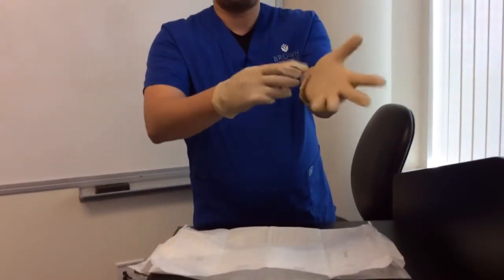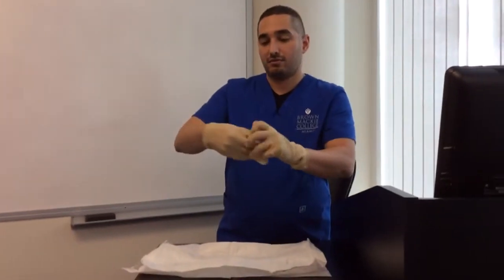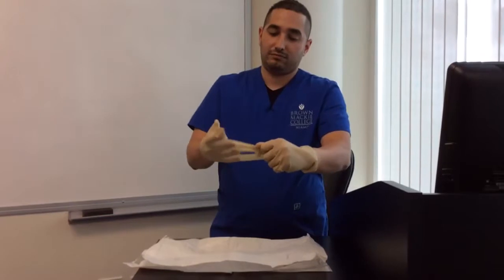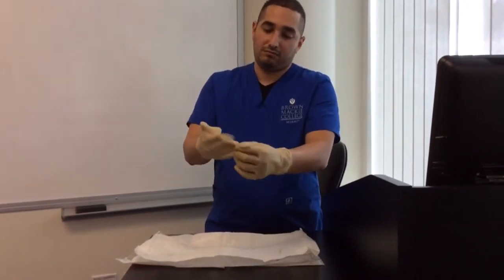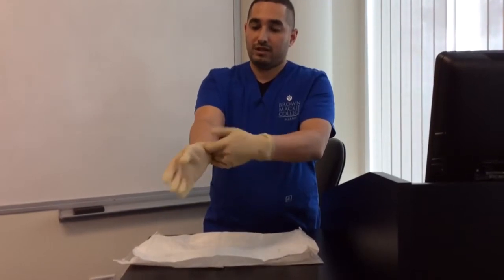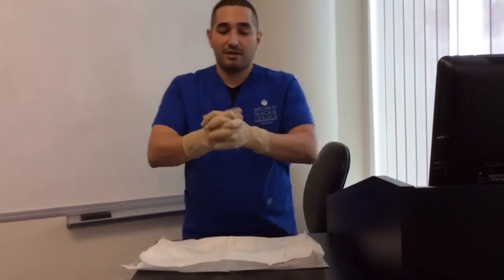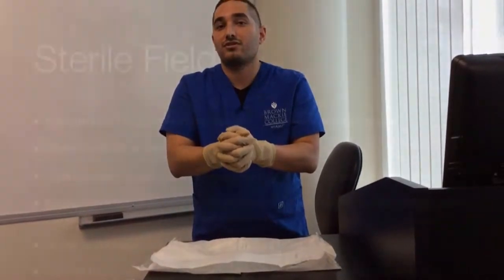If you have any issues putting on the glove, it's not a problem. After you put on your gloves, you can just fix your gloves since they're both sterile. Make sure you can touch glove to glove. You cannot touch skin. Make sure after that you just use your fingers to make sure it's all good, and then you just keep it in this position until you're ready to perform any procedure you're going to do.